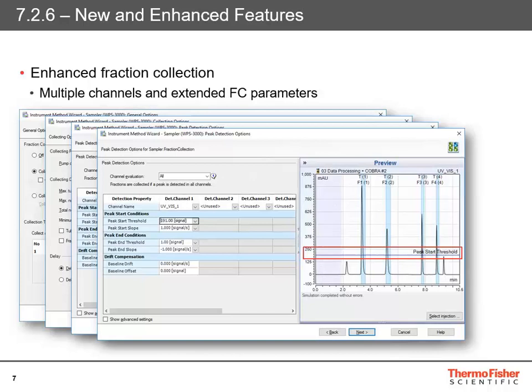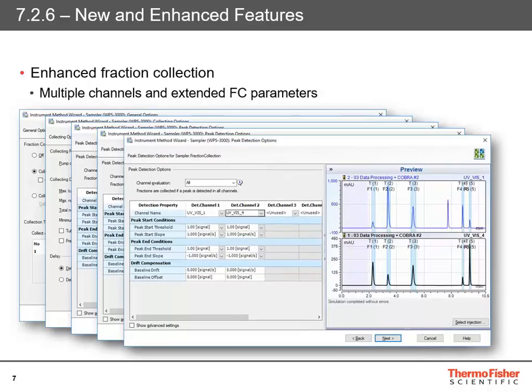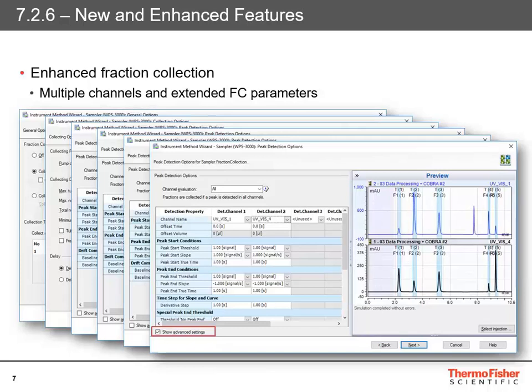Those bars have shifted slightly to the right. The newest feature here is multiple channels. As I add another channel, the simulation now shows the second channel as well, looking for peaks on both channels and showing where they're going to be collected. The second channel may be an FLD or different detector, or just a different wavelength. Channel evaluation options include detected in all channels, either channel, or a specific single channel. You can have multiple channels set up. There's also a 'show advanced settings' button in the bottom left-hand corner, giving access to all fraction parameter settings for full control. As changes are made on the left, they are reflected and updated in the preview.